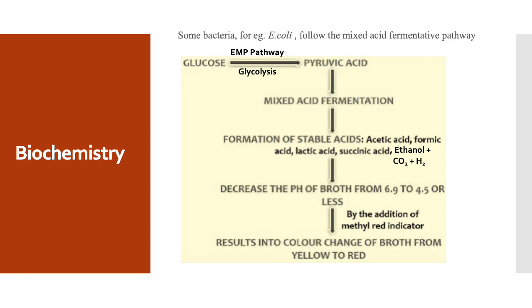In the first stage, glucose from glucose phosphate broth is anaerobically oxidized to pyruvate, which is the end product of this glycolytic pathway. And further, in the second stage, this pyruvate is converted to one or more end products using different pathways which require different key enzymes. And after the different end products are formed, they are secreted from the cell.